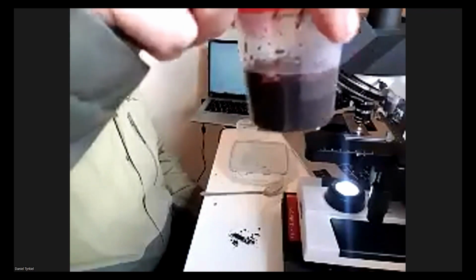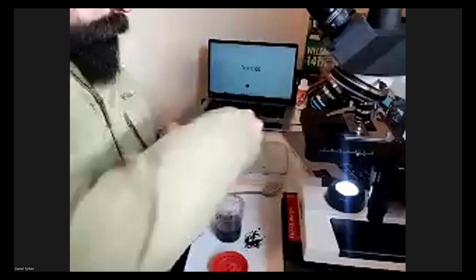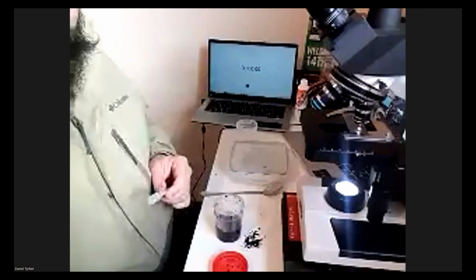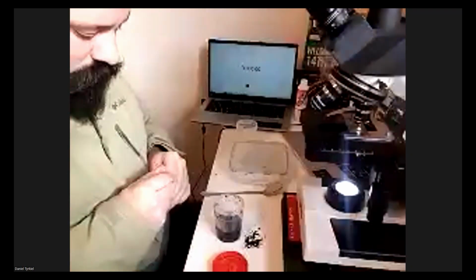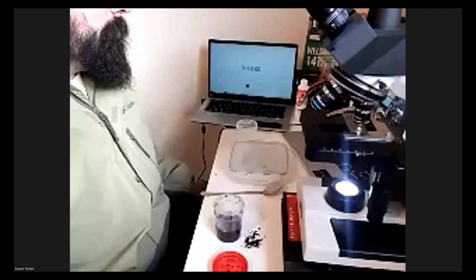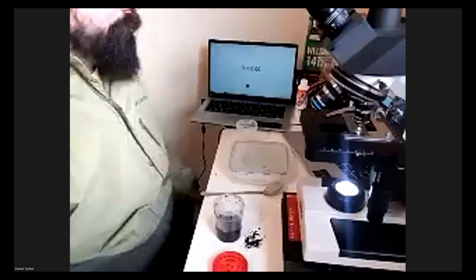The idea behind doing it like that every time is because everything can introduce variability. Even the shaking can introduce variability because this is not a mechanized method. It's a method that requires a technician. It's a method that requires skill. And this is something that Dr. Ingham teaches through her school. Everybody in the lab went through her school. That's important for us, that we have this standardization. And so we adhere to everything that allows us to have repeatability of results.